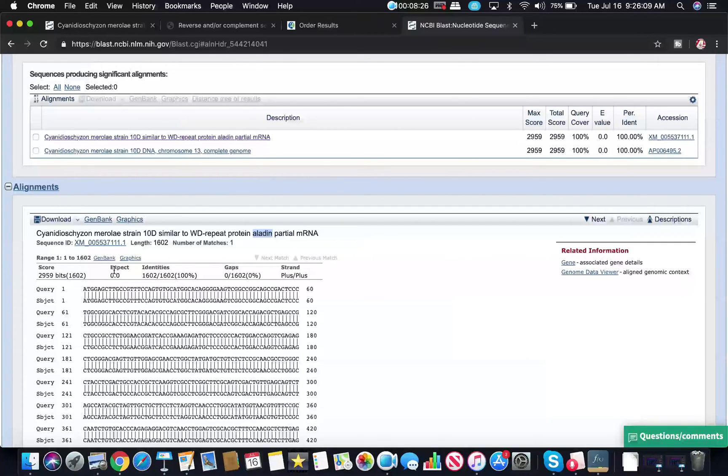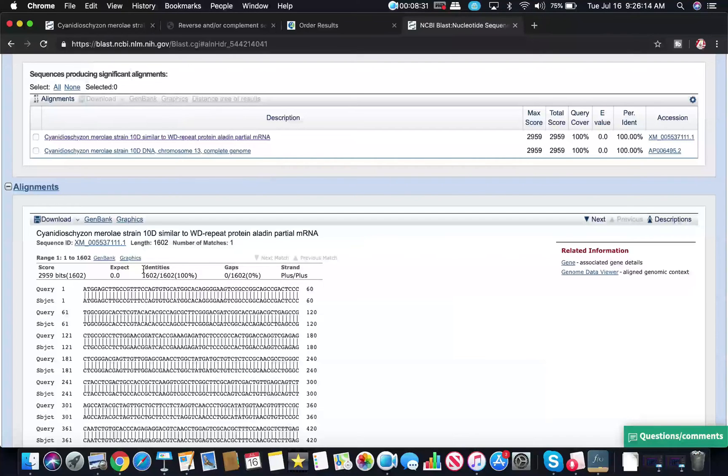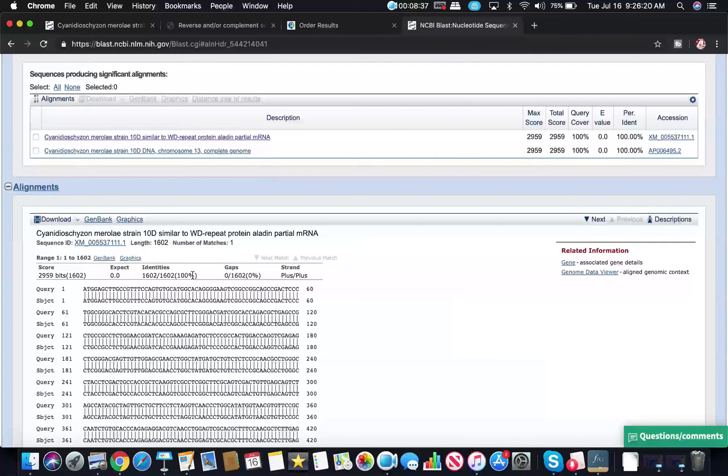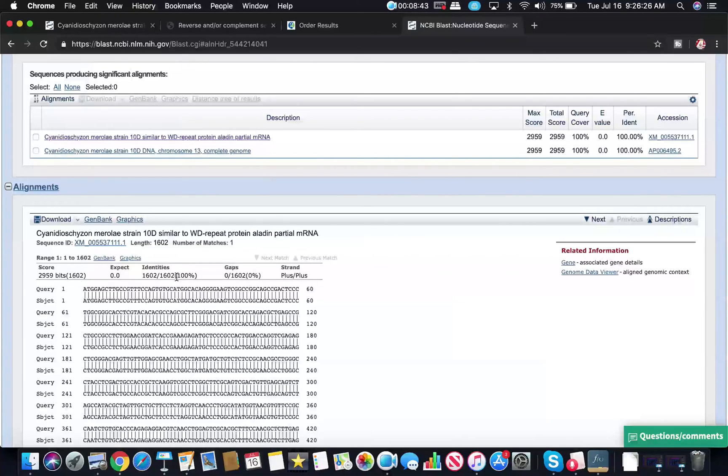There's some scores here such as the expectation value, also identities and gaps. You want the identities to be at a maximum, so as close to 100% as possible. In some cases there might be some errors and it might be a little bit less, but the identities you want maximized. So closest to 100%.